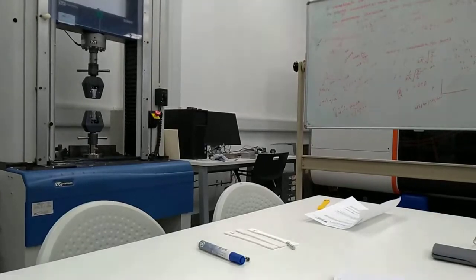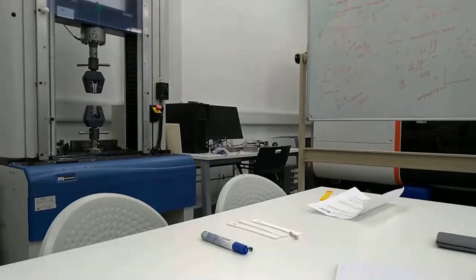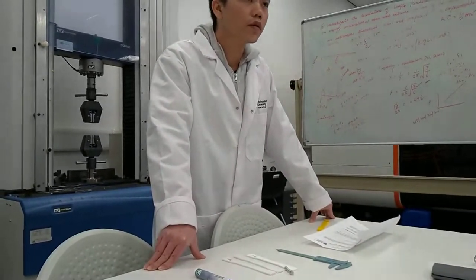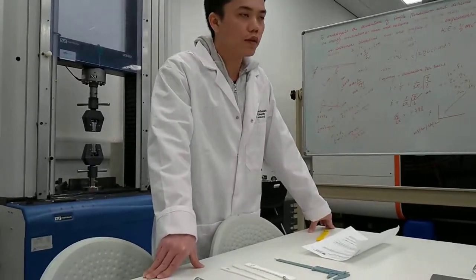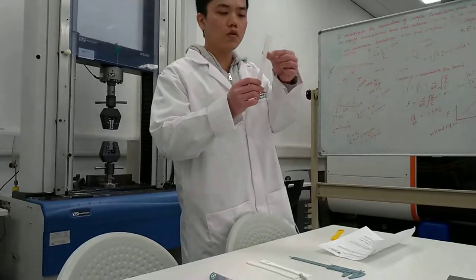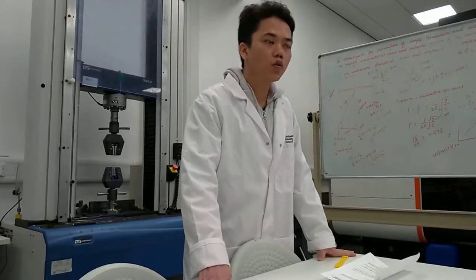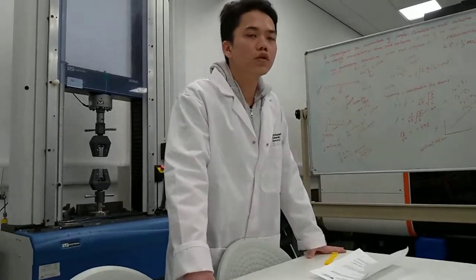The thickness. So please tell me why we need to know about the gauge length. What is gauge length? Distance between the marks of these. Correct. So why do we need to know about the gauge length? Because we need to know how much it's changed from the origin. That's good. How about the thickness and the width? Tell me what width and thickness you need to know. In the middle. Okay. What do we call it? A cross-sectional area. So why do we need to know about the width and the thickness of that area? Stress changes during the test.